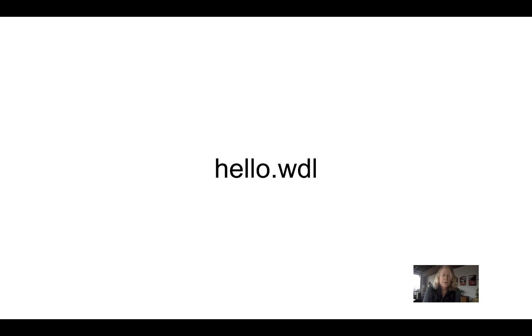So the first exercise will be Hello WDL. And I'll go ahead to the next screencast and we'll verify the environment and then we'll get into Hello WDL.